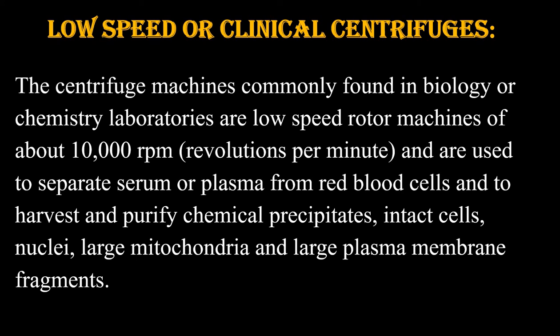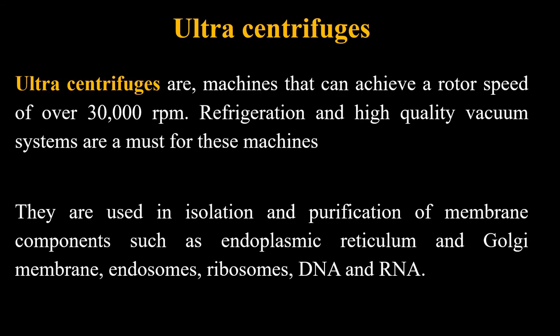These are generally used in the laboratories. Here the test tube holders lie opposite to each other. The samples placed in the centrifuge machine are of equal volume.